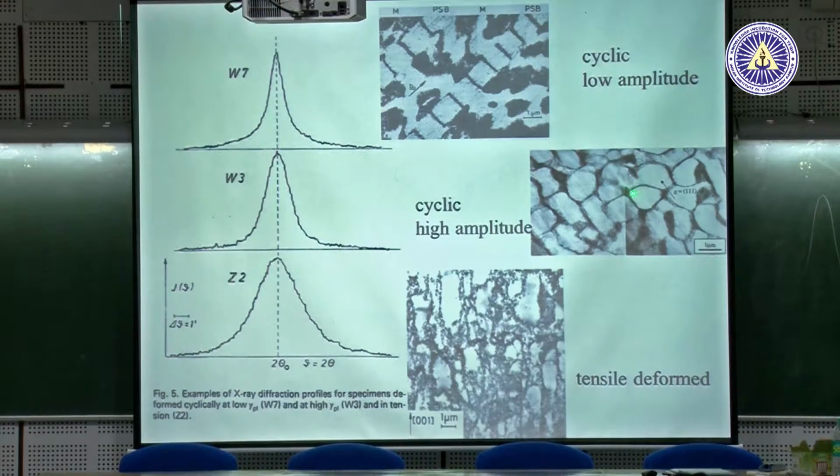That is shown here. And the cell walls are loose dislocation configurations where the dipole character is not so strong. Okay? So the tail becomes shorter. I don't know if you can see that in this curve the tail is long, whereas in this one it is short. You can see that.